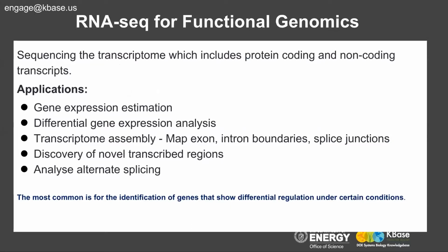So functional genomics is a branch of genomics that determines biological functions of genes and their products. It is a study of how the genome, transcripts, proteins, and metabolites work together to produce a particular phenotype. But this cannot be achieved without relying on high throughput sequencing technology. So RNA-Seq is a very successful application of next generation sequencing technology for genome-wide expression analysis.